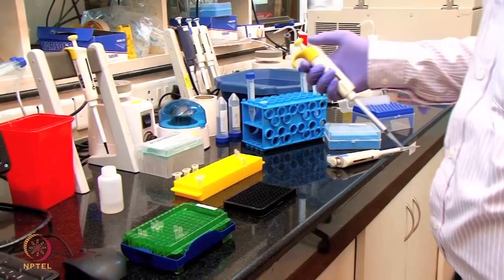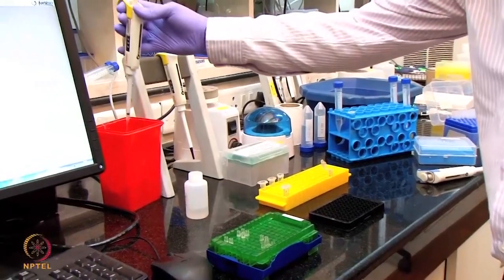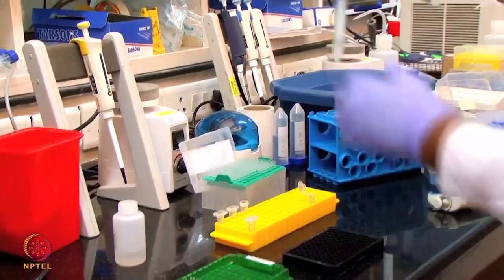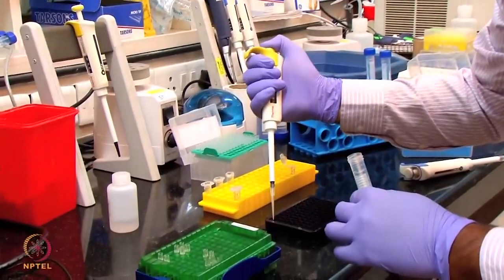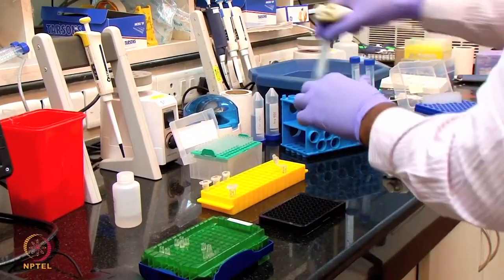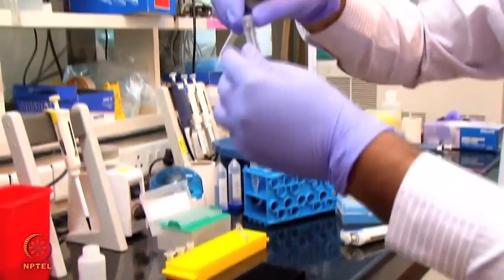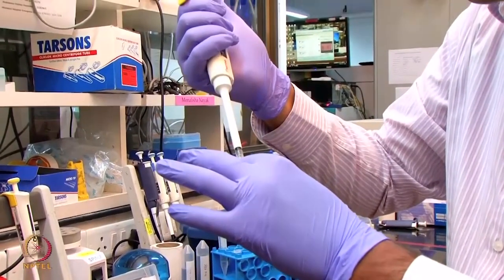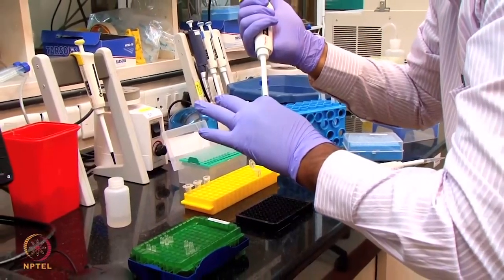Now I am going to demonstrate how we are going to immobilize the anti-apolipoprotein onto the streptavidin sensor. I'm taking 200 microliter of the 1x PBS buffer. This is prepared. I'm going to add 200 microliter to each well of the 96 well plate. Putting in the biotinylated anti-apolipoprotein, I am now going to add 200 microliter of the biotinylated anti-apolipoprotein to the 96 well plate.